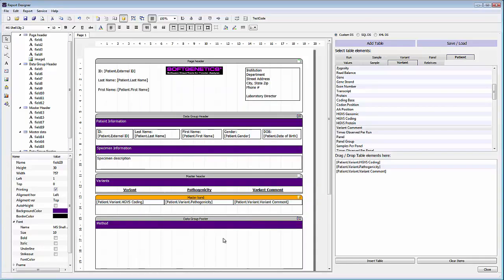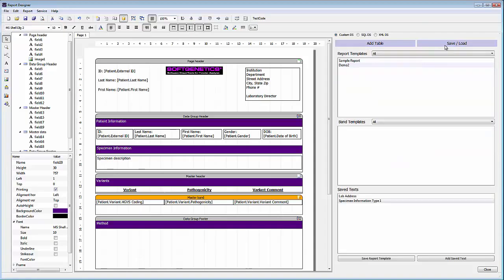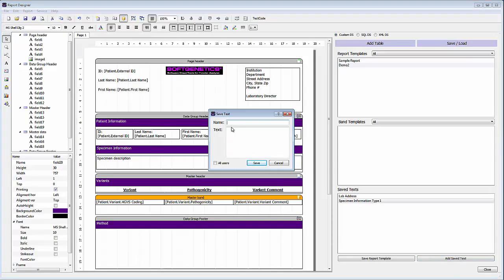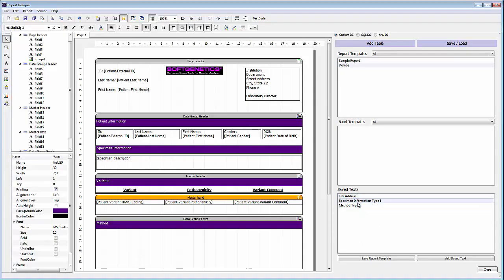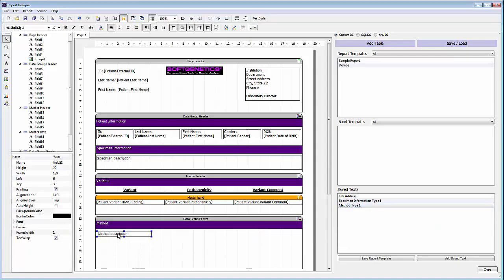For the methods, we'll again use the option of creating a saved text. We'll go back over to save/load on the right side and add a new saved text. This will be a method — we'll call this type 1. You may have multiple different types of methods used in different report templates. You would type in or copy and paste your method description and then save that. Under saved texts, we'll just click and drag the method saved text and make this field a bit larger.